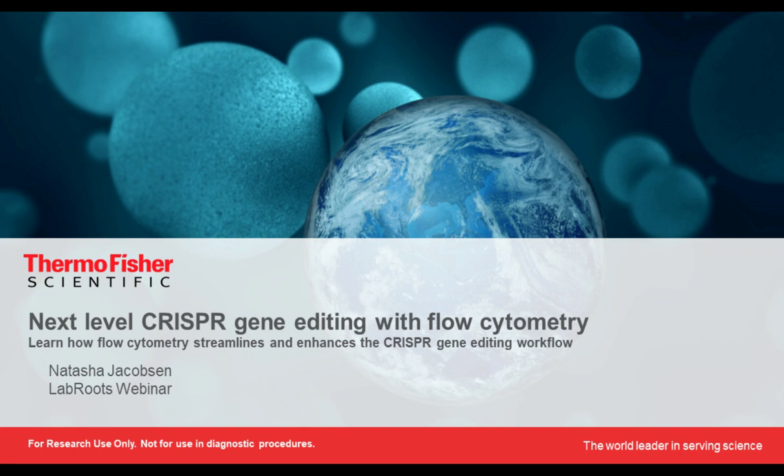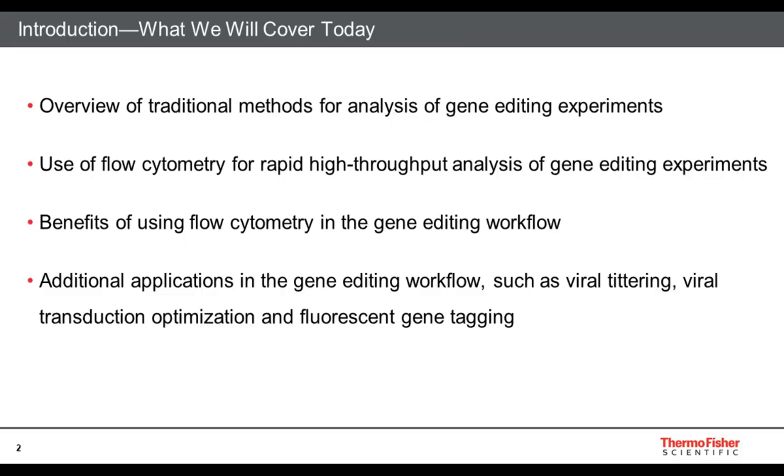Hi, thank you so much for joining. Today I'm going to discuss next level CRISPR gene editing with flow cytometry and how you can use the power of flow cytometry to streamline and enhance your CRISPR gene editing workflow. More specifically, we'll discuss some of the traditional methods for analysis of gene editing experiments, and then we'll talk about how flow cytometry can be used for rapid high throughput analysis of these gene editing experiments.